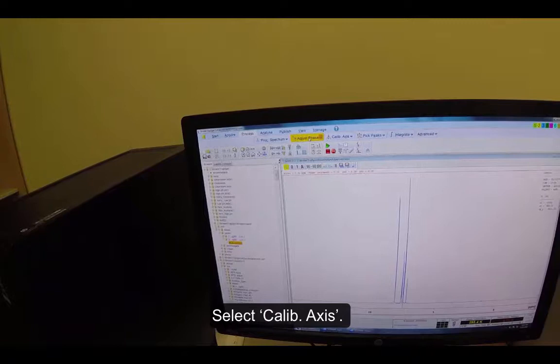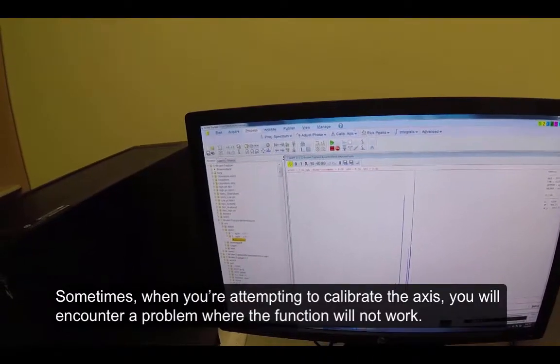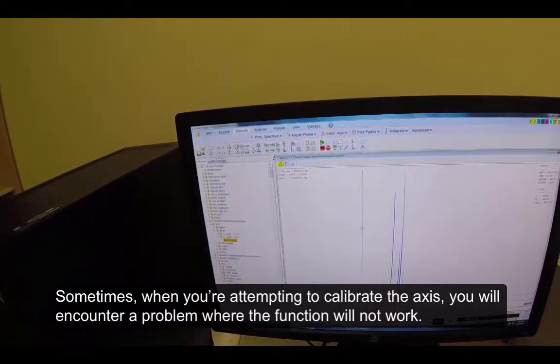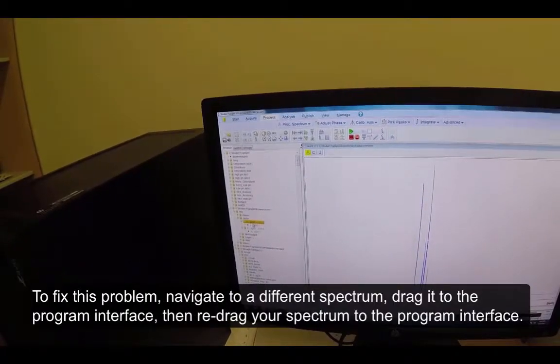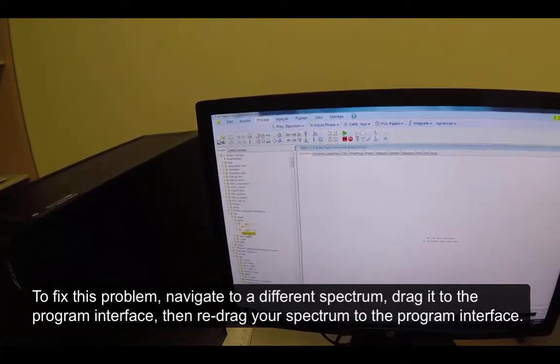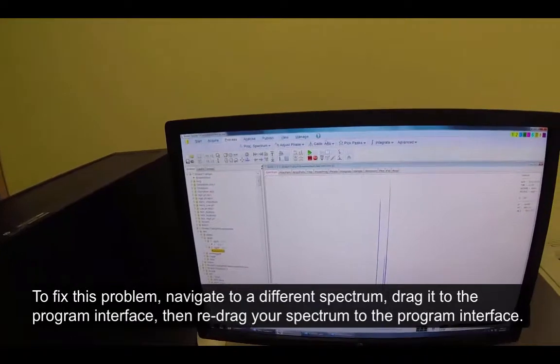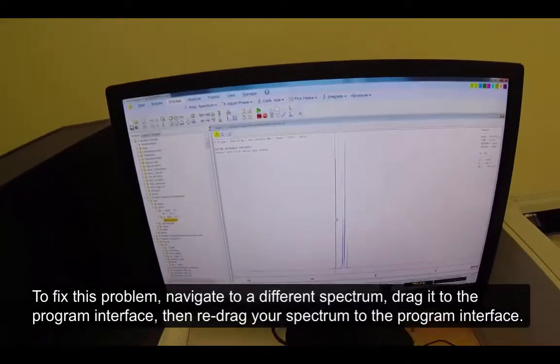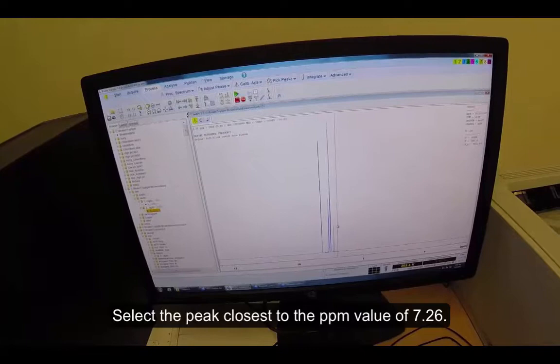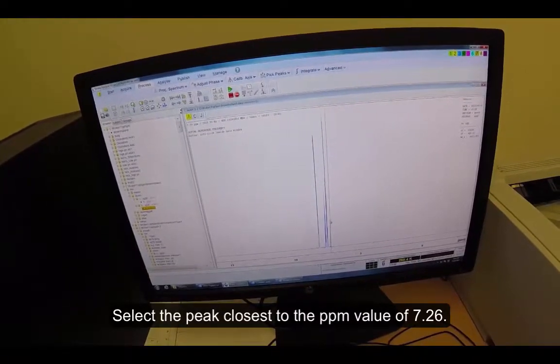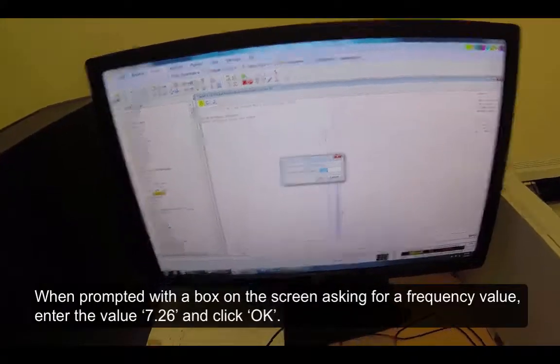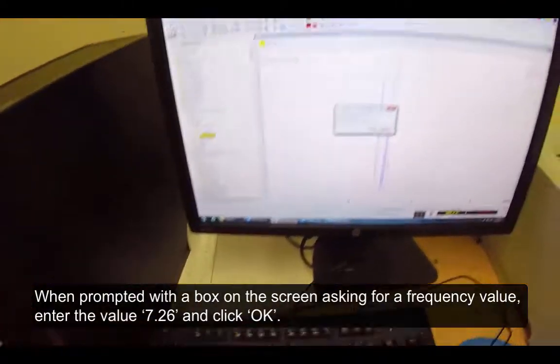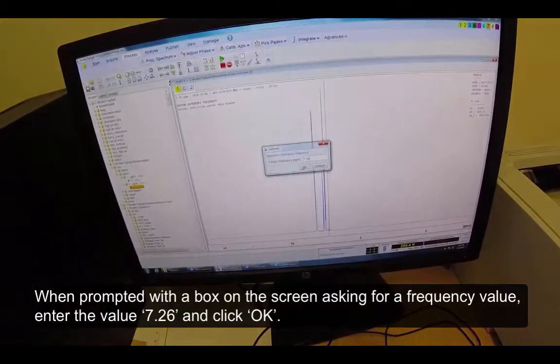Select Calibrate Axis. Sometimes when you are attempting to calibrate the axis, you will encounter a problem where the function will not work. To fix this problem, navigate to a different spectrum, drag it to the program interface, then re-drag your spectrum to the program interface. Select the peak closest to the PPM value of 7.26. When prompted with a box on the screen asking for a frequency value, enter the value 7.26 and click OK.